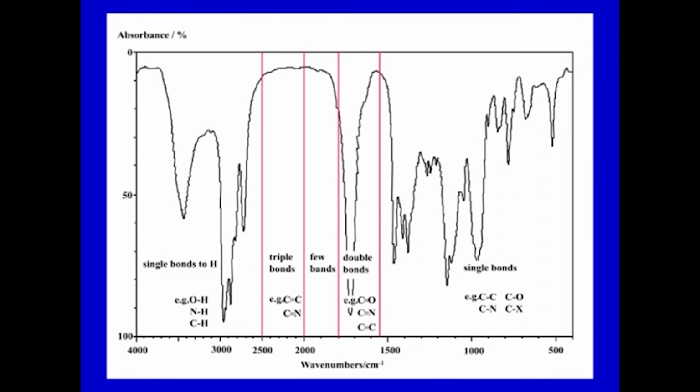The OH and NH stretching frequencies fall in 3700 to 2500 per centimeter, with various intensities. Hydrogen bonding has a significant influence on the peak shape and intensity, so that is also very important. Then the CH stretching bands occur in the region of 3300 to 2800 per centimeter, and we can go on, where different kinds of aliphatic, saturated or double bond compounds have characteristic spectra. Different regions could be taken.